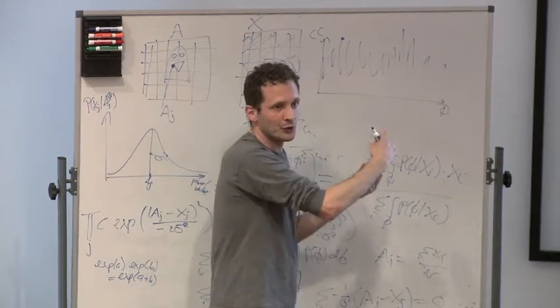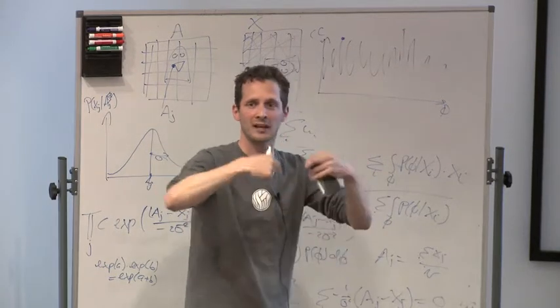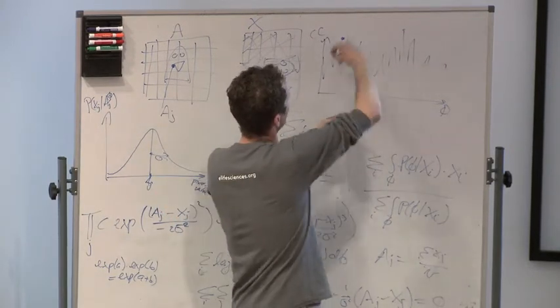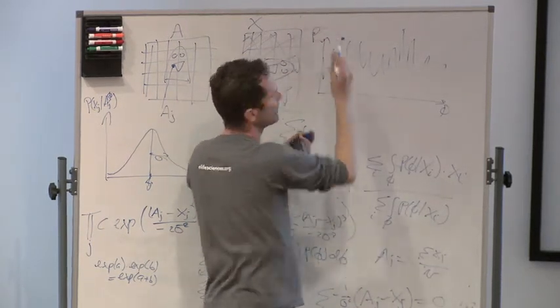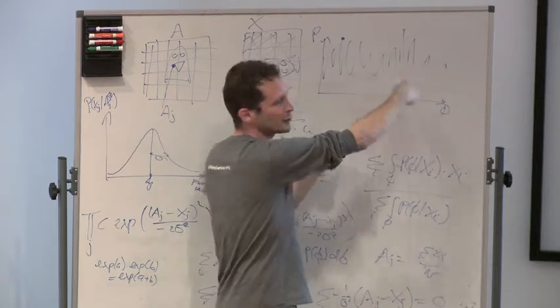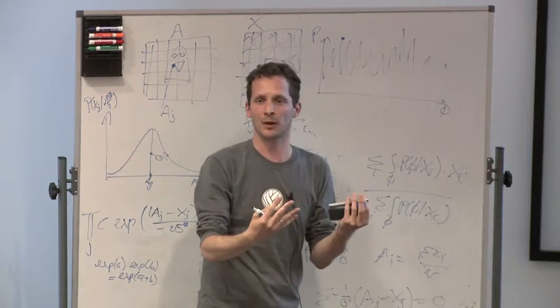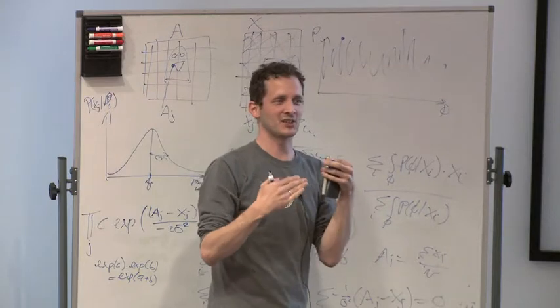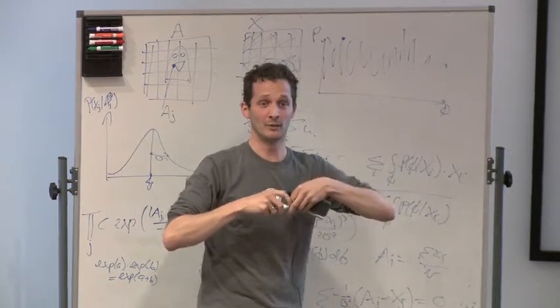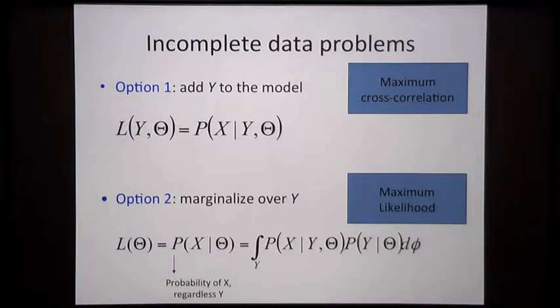What maximum likelihood does differently, it puts this value of cross-correlation or squared difference into this exponentiation, and it will calculate a probability, which we could, to some extent, just replace this here. Okay. Now, if there's so much noise in the data, you can't distinguish whether it's this view or this view, then they just go in with rather similar probabilities. So you kind of postpone taking that decision until you hope at some point it will be easier to make. Okay, that's a bit of an intuitive explanation to it, but that works actually better in terms of convergence behavior.